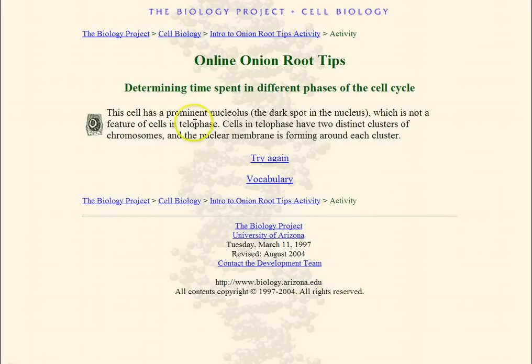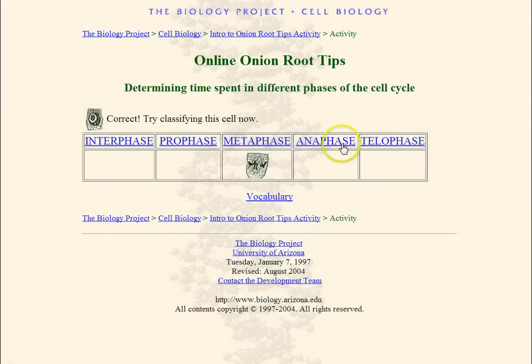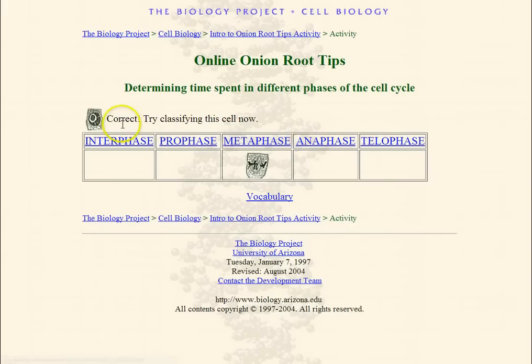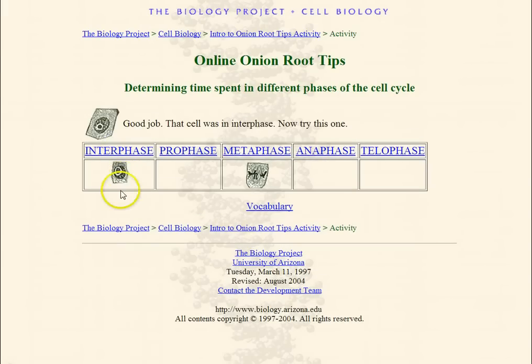Let's say telophase. It says nope — this cell has a prominent nucleolus, which is not part of the cells in telophase. Telophase has two distinct clusters. So I'm going to try again — I know it's not telophase. In this case right here, I can see the nucleus and the nucleolus. That tells you it's going to be in interphase, so you put it down there.